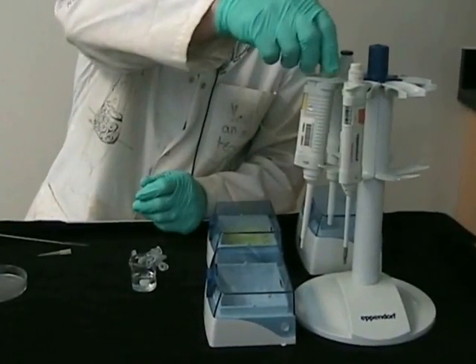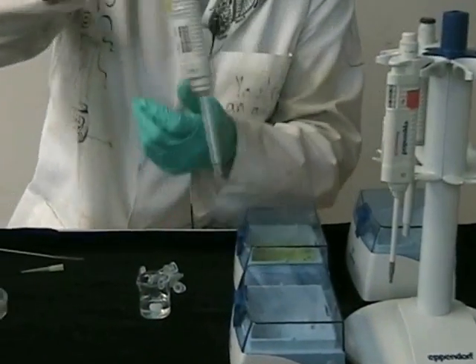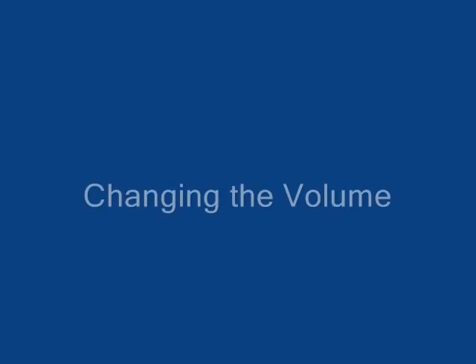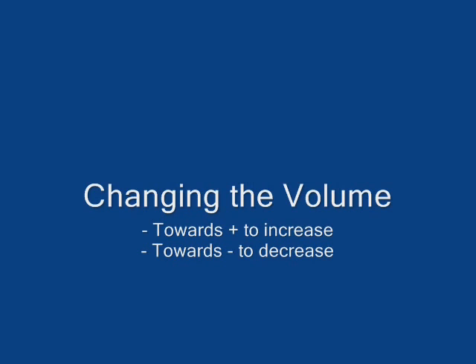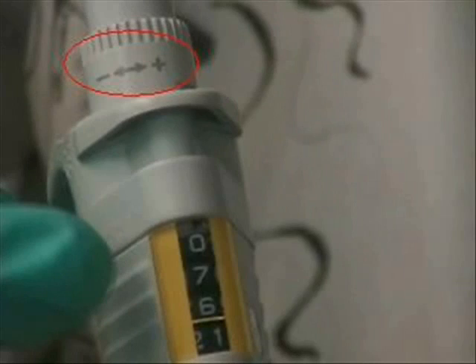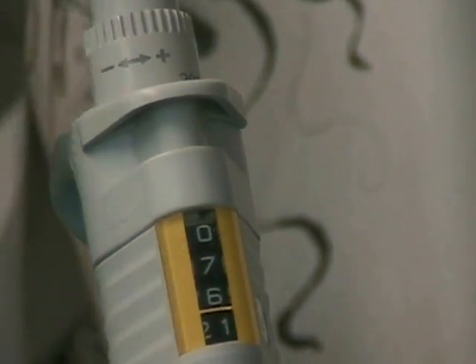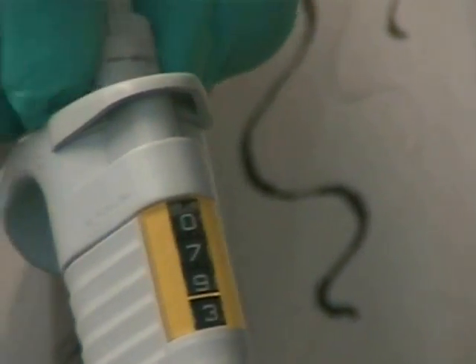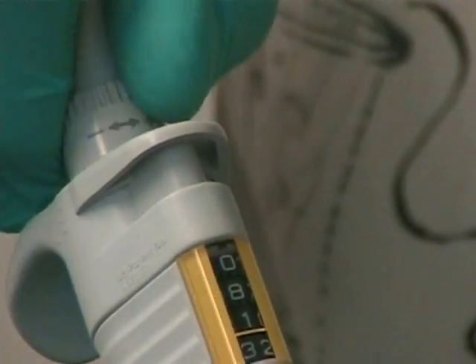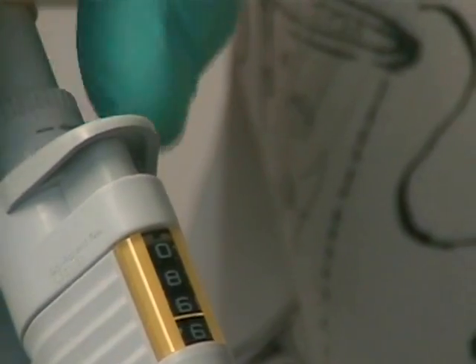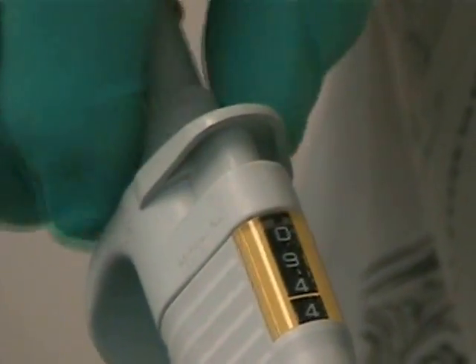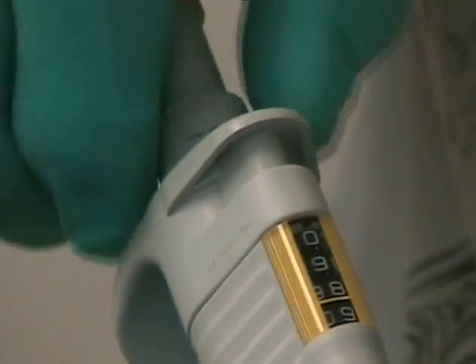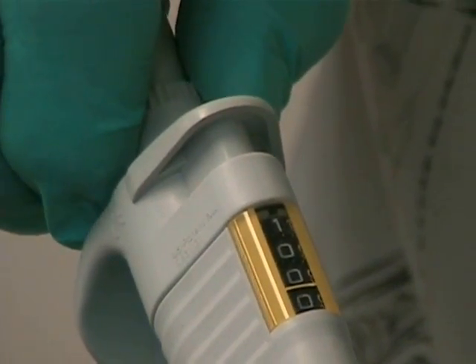In this video we're going to look at how we adjust the volume of a pipette. To change the volume, you can dial up or down according to the volume you want. In this exercise we want to pipette 100 microliters. I'm dialing up, and when I reach 100, it's imperative to make sure you've corrected the fraction to 0.0.